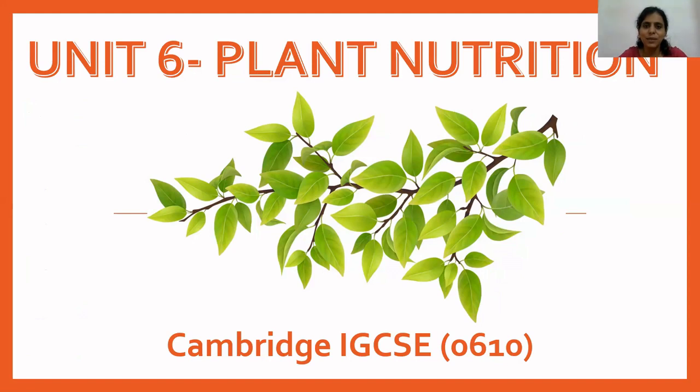Hey guys, in this video we're going to discuss how to perform a laboratory test for testing the presence of starch in a leaf. In the previous video we discussed photosynthesis, and there we saw that in the process of photosynthesis, glucose, which is a carbohydrate or an organic material, is synthesized by all green plants.